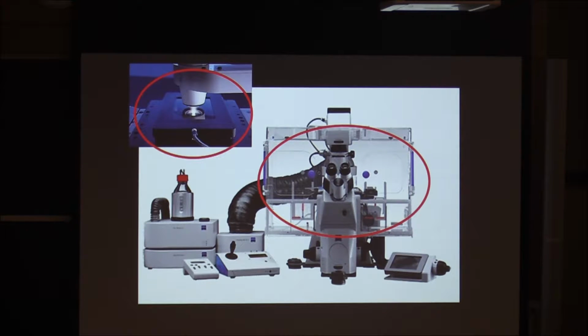But along with that big box, we often also have a heated stage insert. So this is actually two pieces here. There's a black lid on the top, and then on the bottom there's another piece of black metal that's plugged into the stage. And that's an actual heated insert, so that whole insert heats up as well. So that just gives you a little finer control.